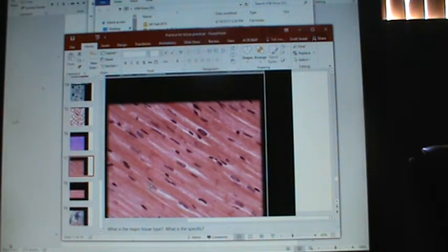Or any other structures that make it distinctive? Well, this is cardiac muscle, and it has intercalated discs here and there along the way. These small little separations you see. Is it starting to stand out now? And if you look really, really closely, very lightly, there is a striation pattern, but it's nothing like skeletal muscle, okay? Okay, now let's do another one.